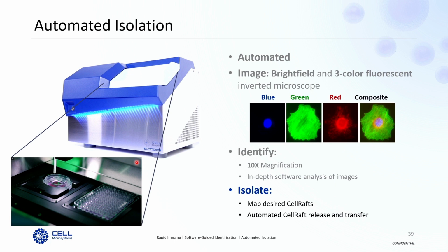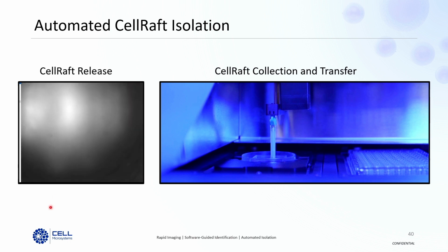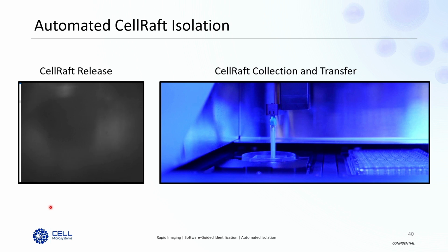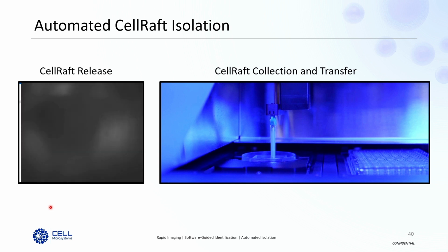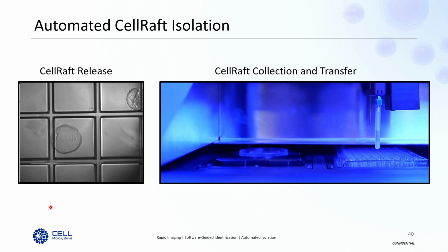So the air system, as I mentioned, performs the automated release and transfer of those cell rafts to the 96 well plate. In the beginning, I showed you an animation of what this looks like, but I always like to show the real-time view. So here, again, to orient you, this is a 500 by 500 micron raft with an organoid on it. As I play the video, you'll see the focal plane go out of focus. That's the needle releasing that cell raft from the microwell. The magnetic wand dips in, picks up that cell raft while the organoid remains attached. After the wand has retrieved the cell raft, it transfers it to the 96 well plate at your desired location.